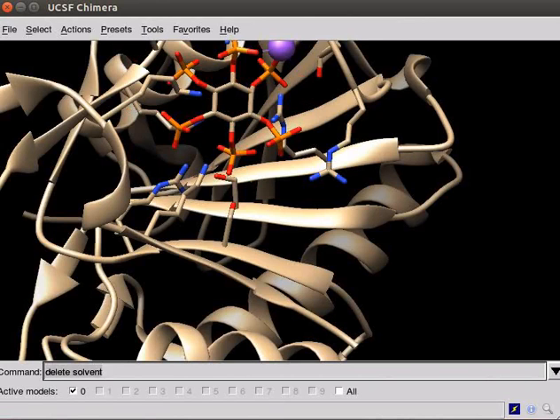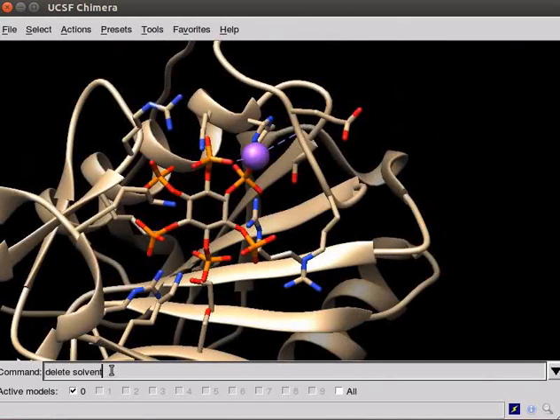To delete the sodium ion, which is present along with the ligand, type delete ions. Press enter. Now, we can display the structure of protein using presets option.